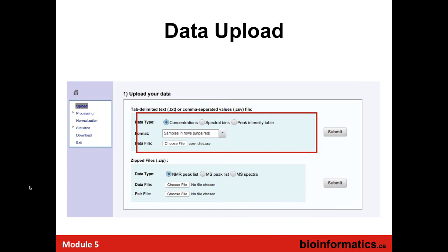Once you've clicked that panel, you're going to see this screen here. There's a little window on the left, which is hyperlinked, which is a process window that takes you through steps: step 1, step 2, step 3, 4, 5, and 6. So that first step is upload. And you have two options. One is to take a tab-delimited file. The other is to take a zip file. And you can take those files that you've downloaded, or files that you generated yesterday, as you wish.